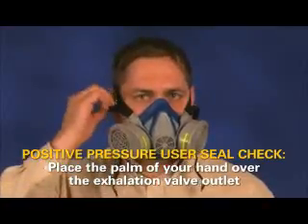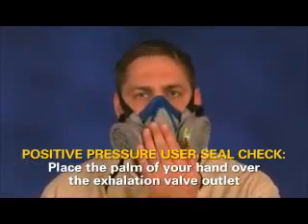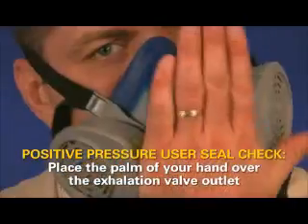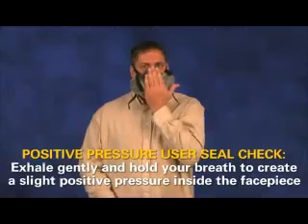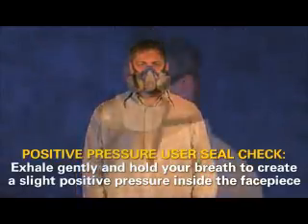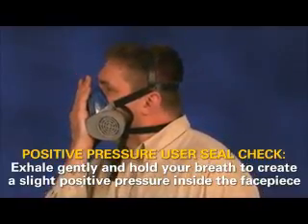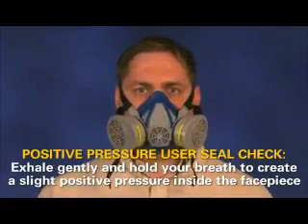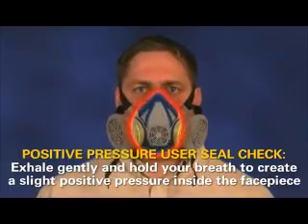Next, perform a positive pressure user seal check. Place the palm of your hand over the exhalation valve outlet. Do not push so hard that you distort the natural shape of the facepiece. Exhale gently and hold your breath to create and maintain a slight positive pressure inside the facepiece. If the facepiece bulges slightly and no air leaks are detected between your face and the facepiece, a proper fit has been achieved.